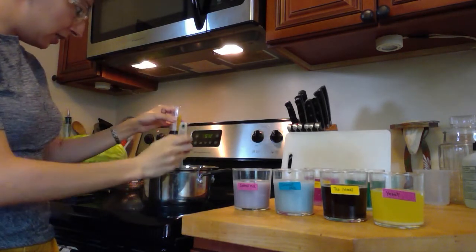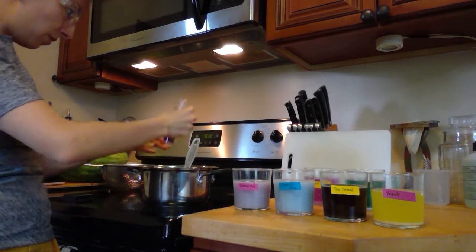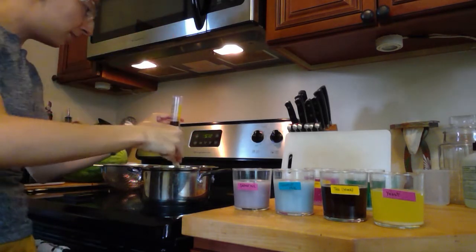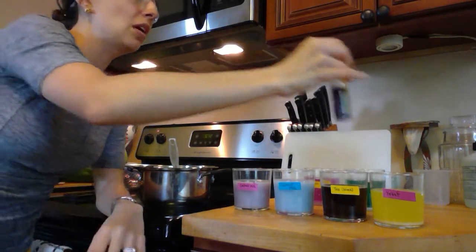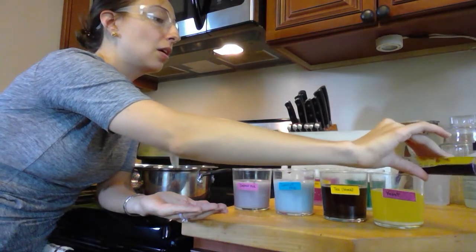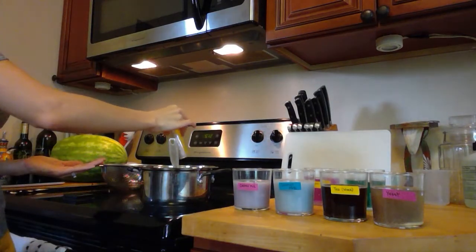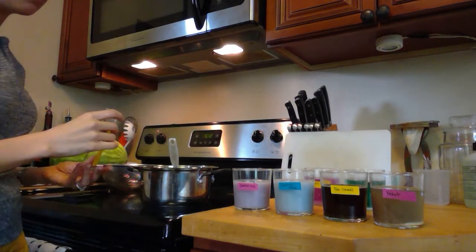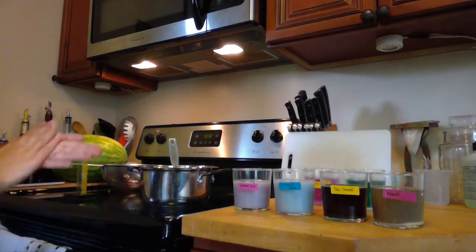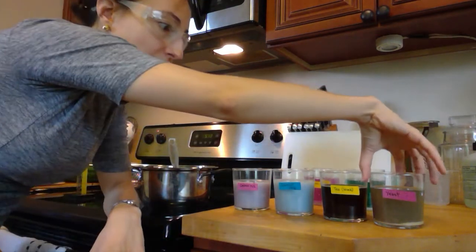And my last one is nutritional yeast. Again, I want 25 milliliters, eyeballing it at your meniscus level. Remember, my yeast is starting out a bit yellow, so that will change. And there we go. Ooh. Now, if you have something with sediment, it might be worth letting that settle a little bit so you can see really clearly the liquid involved. And I'd certainly say that turned more of a green color for my yeast.